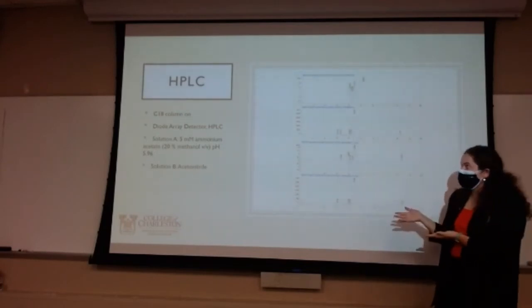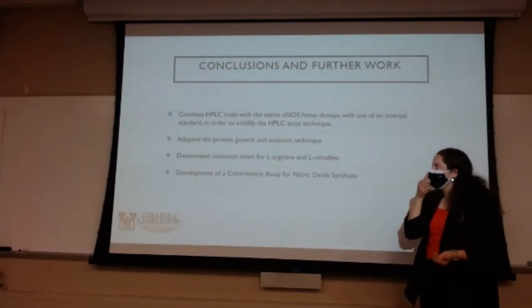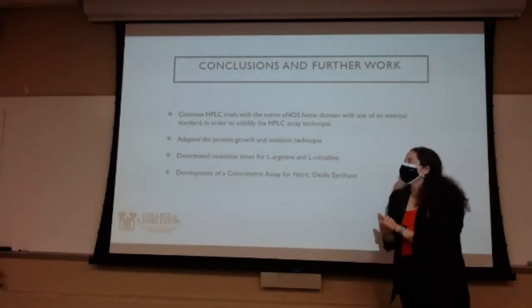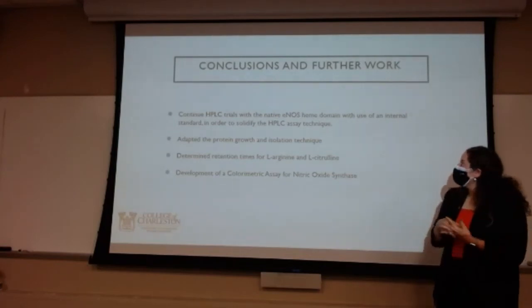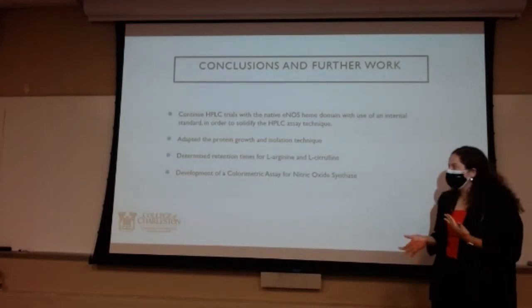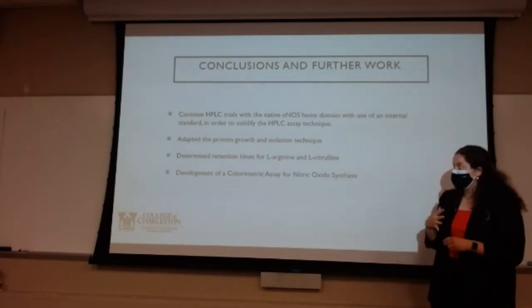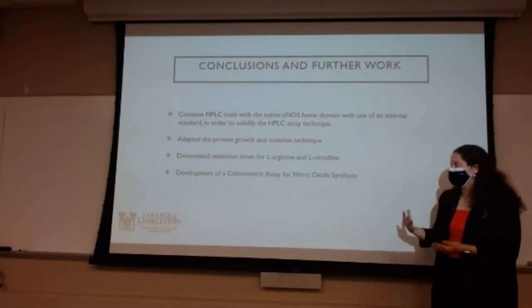So this has been kind of the progress of now is the HPLC. For conclusions and for further work, I'm hoping that the lab continues on the HPLC trials with the native eNOS heme domain with use of an internal standard in order to solidify the technique a little more. And also some things that I was able to do this year were adapt the protein growth and isolation techniques and determine retention times for L-arginine and L-citrulline.